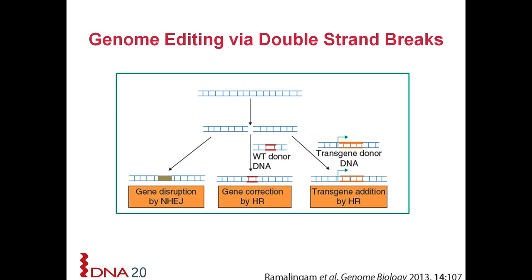Okay. Is the transformation done with plasmid stable in the host? Depends on the system, so in the mammalian system, our plasmid, that's why we have the reporters there so that we can make sure that they're still being expressed. In our hands, certainly 3 to even 7 days we have seen expression of the reporters, so I'd say they're fairly stable through that. They're certainly stable enough to generate the change we need, and then we can get rid of the plasmids as needed. Because after the job is done of editing, you don't want to have the plasmid linger around too long. So it certainly sticks around long enough to do the intended editing in mammalian cells.